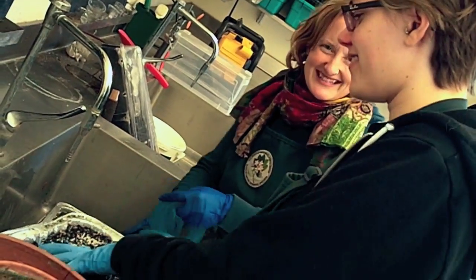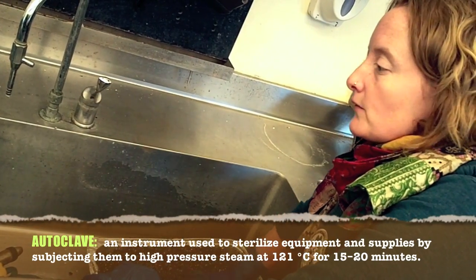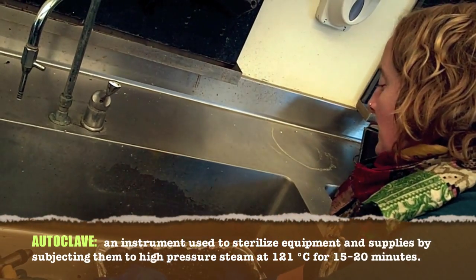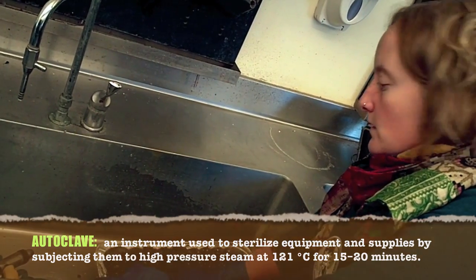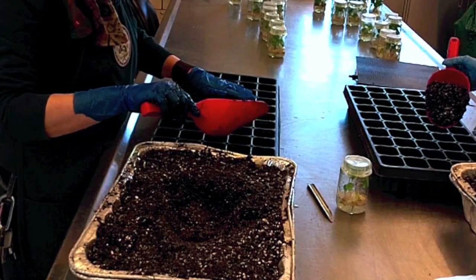My favorite part of our job is getting my hands dirty. We're using completely sterile soil — we've run it through the autoclave at a really high temperature, just to kill anything that is in the soil. Take it right up to the top and kind of pack it down a little bit.